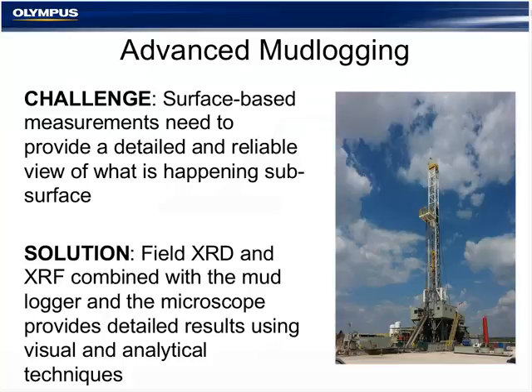Meticulous methods for the sample collection and the sample prep are essential. All data is reliant on that human at the shaker screens doing the frequent and accurate sample catching. And the resolution on the logs is also dependent upon how frequently those samples are caught. The more frequently, even as close as 5-foot intervals, will provide the best resolution onto the log. Reservoir characterization is dependent upon the expert's working knowledge in applied geologic models. XRD and XRF help them provide indicators of geological history, your basin maturity, low-grade metamorphism, and in characterization of lithologies.